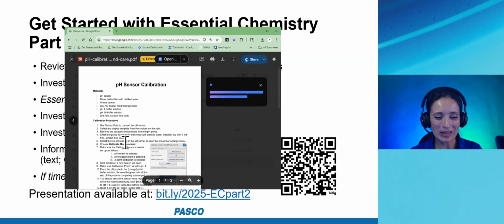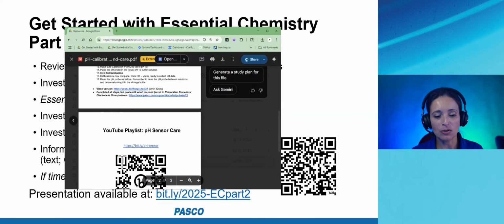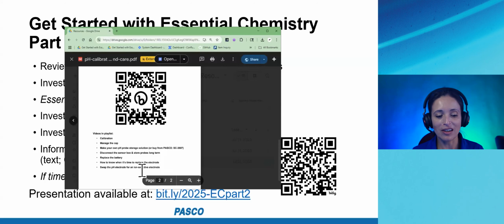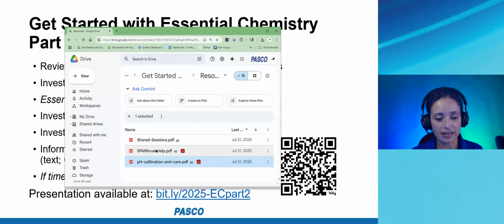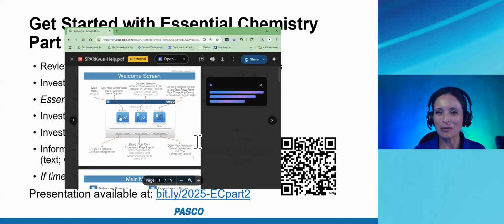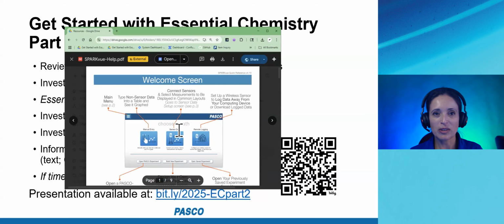This I'm going to open right now. This has how to calibrate, and also a YouTube playlist of sensor care videos. And here are the videos that are there. These are frequently asked questions that I don't have time to go over today, but I think you'll find them valuable if you're using your pH sensor, depending on what you're using it for. So let's go back for a quick look at the SPARKvue help, because you might be wondering what menu you click to get that thing. This is what that document looks like.